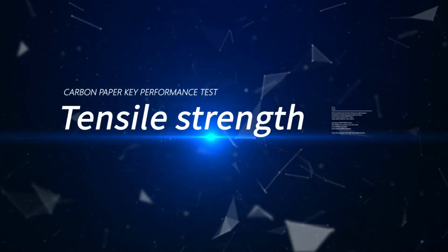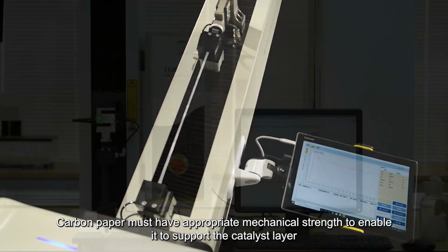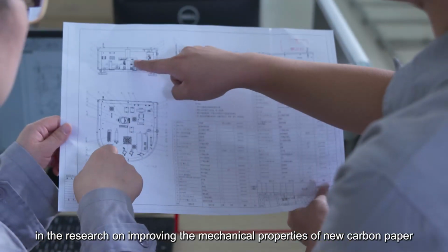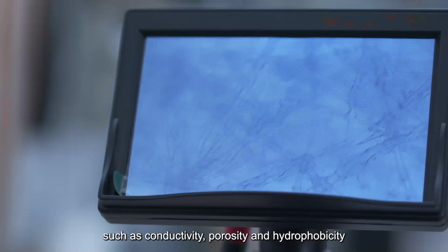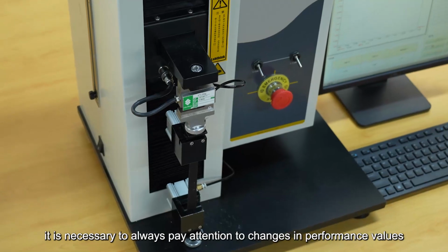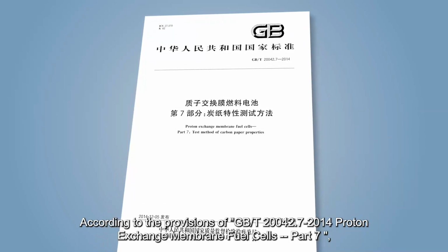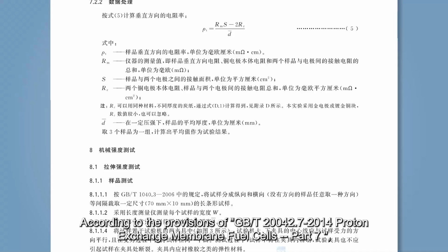Tensile strength. Carbon paper must have appropriate mechanical strength to enable it to support the catalyst layer. Therefore, in the research on improving the mechanical properties of new carbon paper, as well as in enhancing key indicators such as conductivity, porosity, and hydrophobicity, it is necessary to always pay attention to changes in performance values, such as tensile strength.